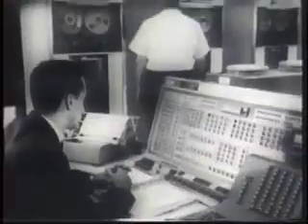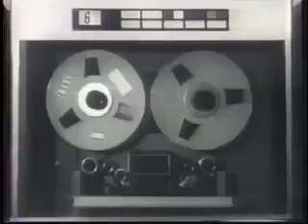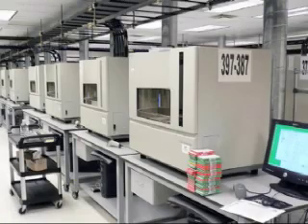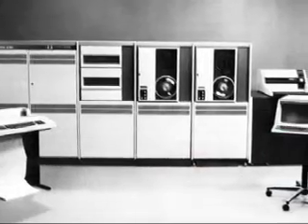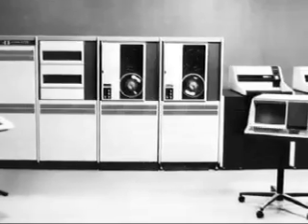Mainframe computers were faster than ENIAC, but still so expensive that only a few organizations in the world could afford to buy and run them. Likewise, capillary sequencers had higher throughput, enabling the Human Genome Project, but few labs had the resources to support them. In the 1970s, the mini-computer put computing technology within reach for hundreds of organizations.